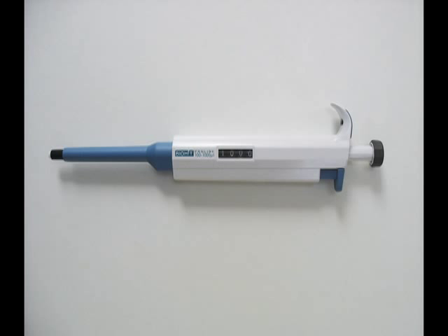A pipette is a common piece of laboratory equipment, used to accurately measure and dispense set volumes.